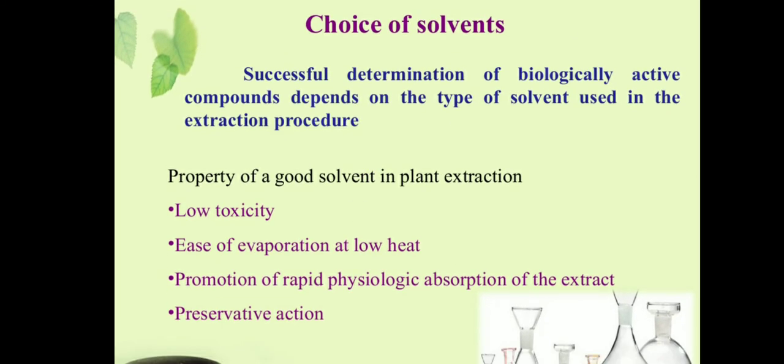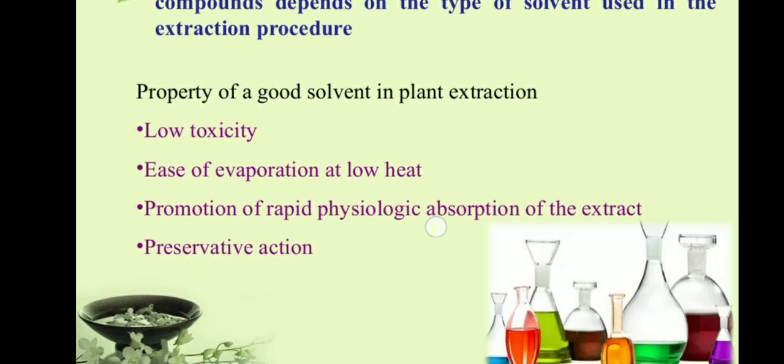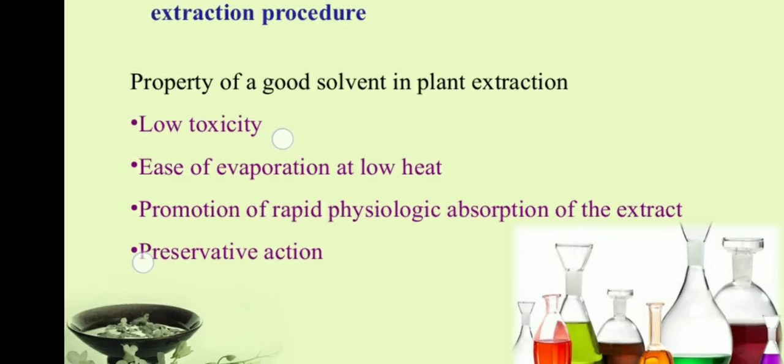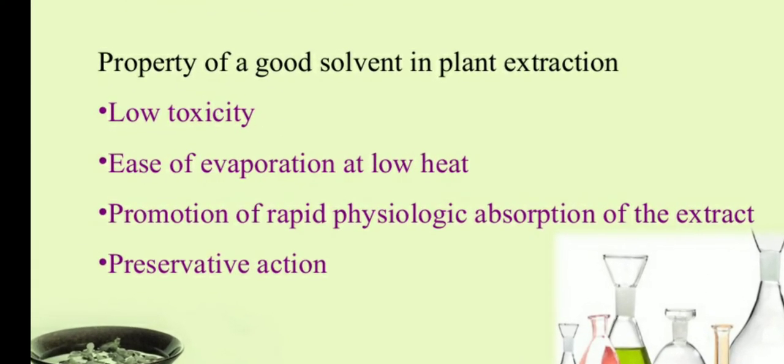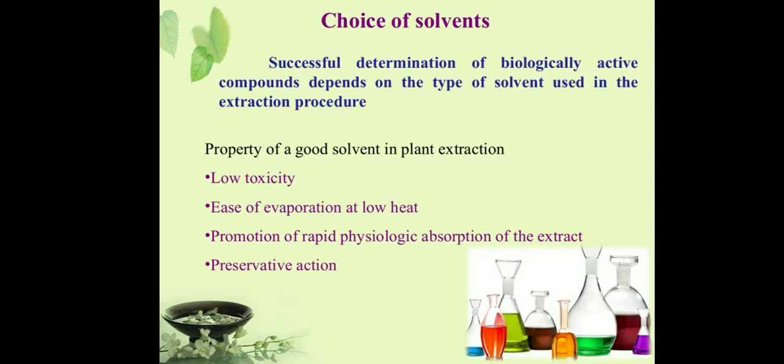What kind of solvent will we use? Successful determination of biologically active compounds depends on the type of solvent used in the extraction procedure. Properties of a good solvent in plant extraction: low toxicity, ease of evaporation at low heat, promotion of rapid physiological absorption of the extract, and preservative action.